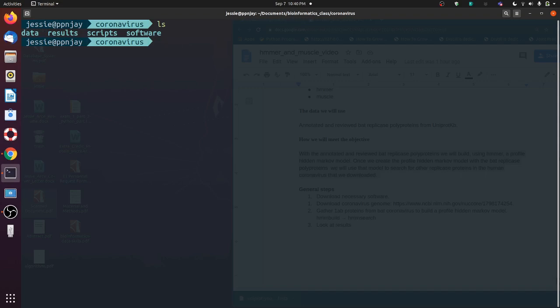that you don't notice. Okay, so now right before I end this, I'm going to create a script to automate this. If I get different data, I don't want to have to keep on typing in all those commands. I just want to create a bash script that's going to execute the commands I just used line by line, so I don't have to repeat myself if I use different data.